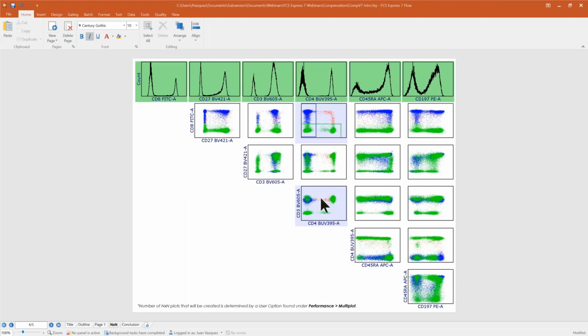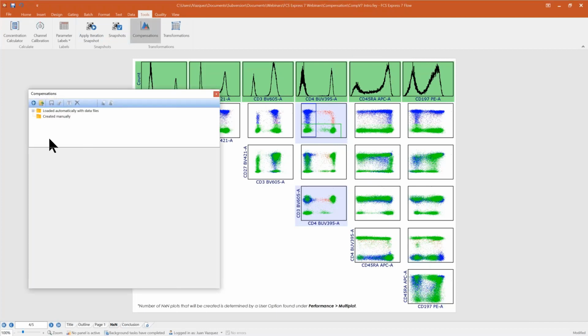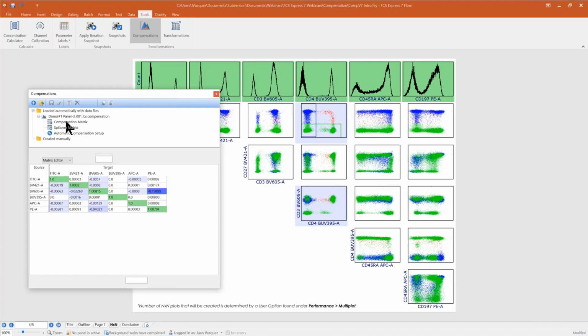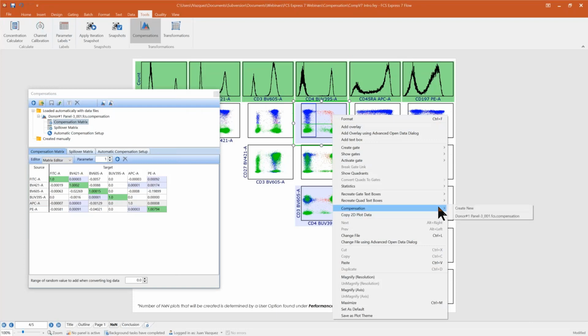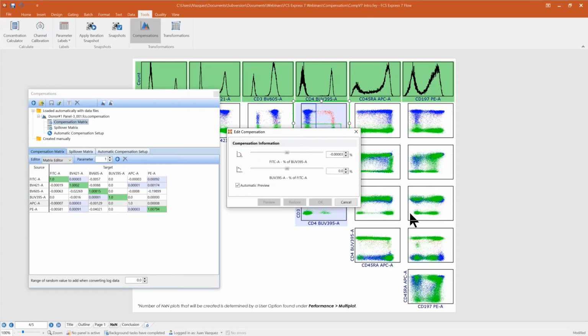What we do is grab the same heat map color shading that we've seen in the matrix earlier and apply that to the background of these plots. Okay, so I can come in and tweak some data either directly in the matrix, or I can right click on one of these plots and adjust the matrix for that plot.